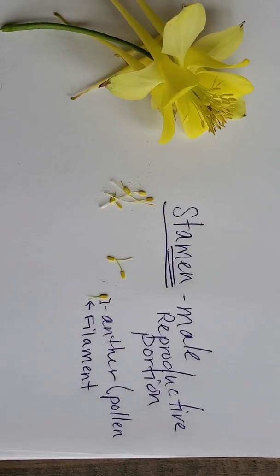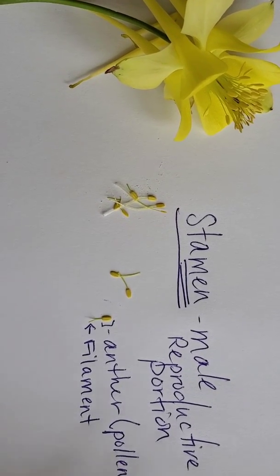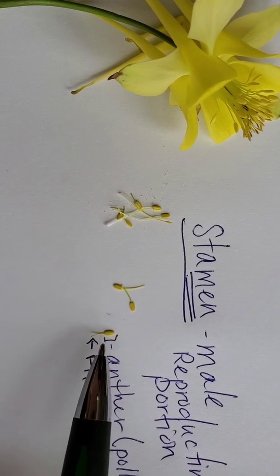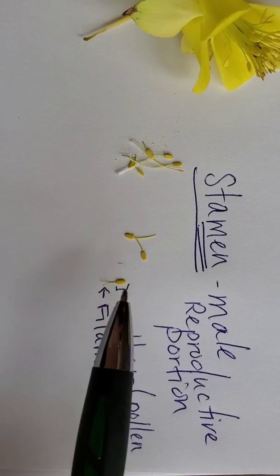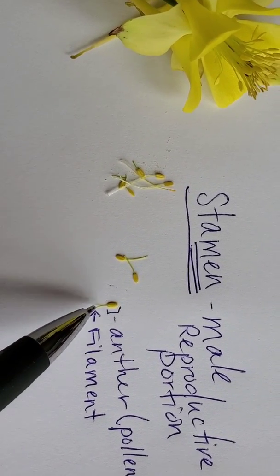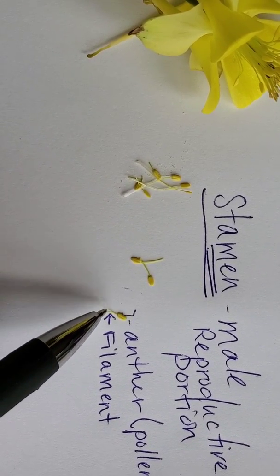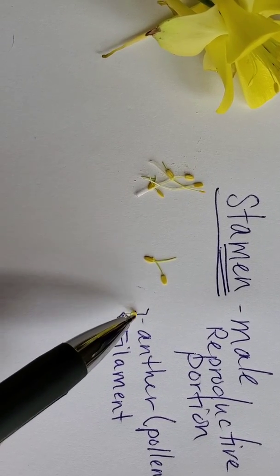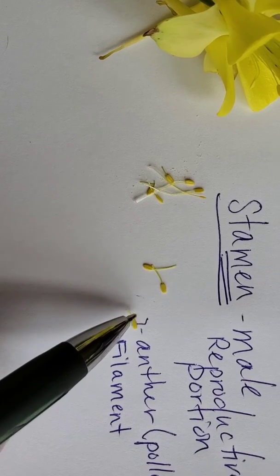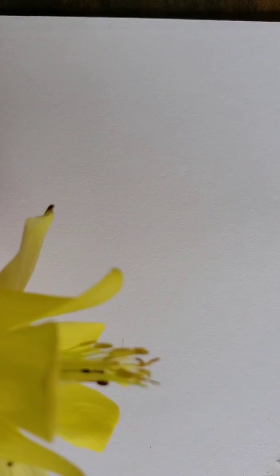Okay, so I pulled off some of the stamen and you can see that we have our anther, which is going to be this top portion right here. This is where the pollen is going to be housed. Pollen is going to be the male reproductive part of that. And then you've got the filament, which is this little fiber right here that's going to hold the anther up, trying to get it as close to the top of the female reproductive portion as it possibly can.